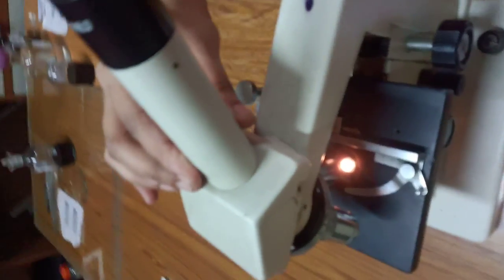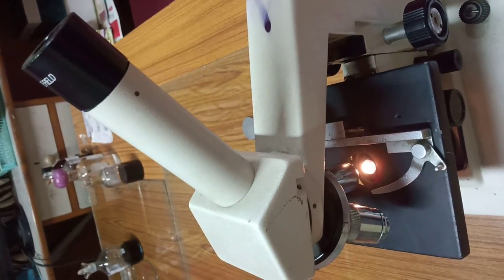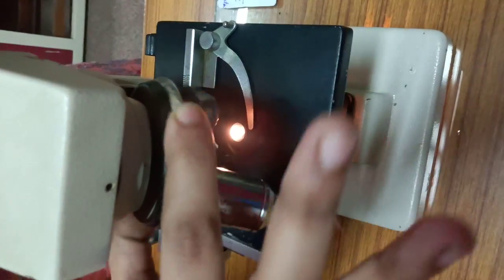This is the body tube. The objective turret, revolver or revolving nose piece. Now this here is known as the revolving nose piece.